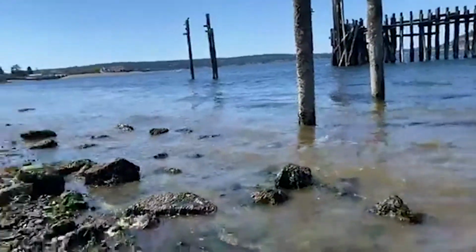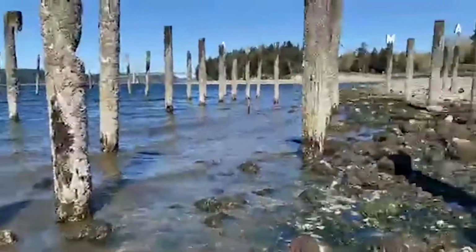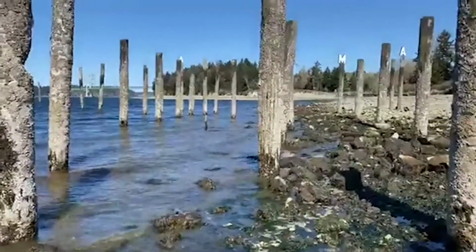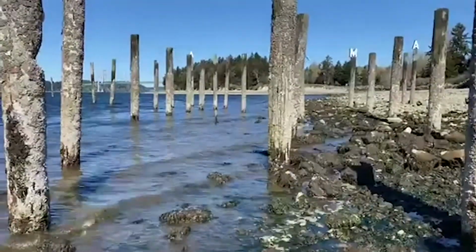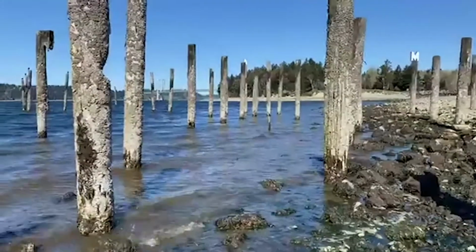So we'll go ahead and call that good so I can collect this water sample, and we'll see what our service is like over at Les Davis in an hour or so. And then we'll tune back in from the lab where we'll be testing our sample out to get it ready to see if there's any fecal coliform present in the different sites that we're testing.